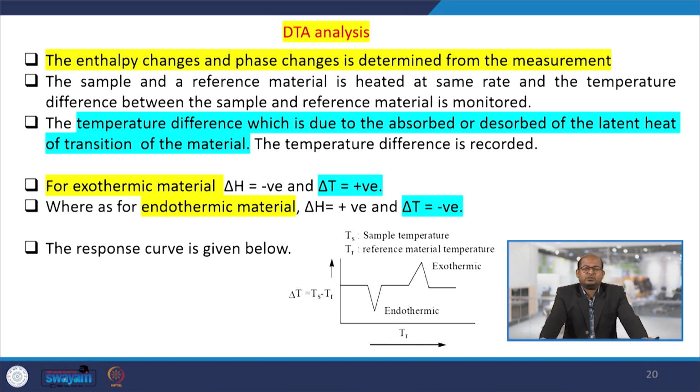Similarly, DTA analysis we can also do using the same experiment. If the y-axis is the temperature difference and the x-axis is the reference material's temperature, then for any material or catalyst undergoing thermal treatment, as we increase the temperature, either exothermic or endothermic reactions may occur.